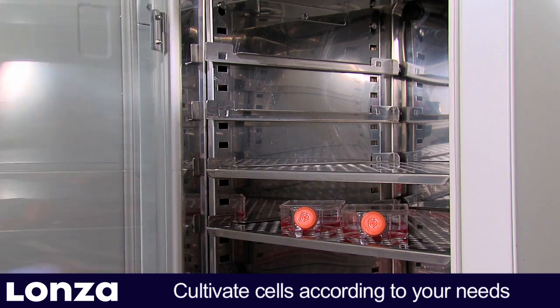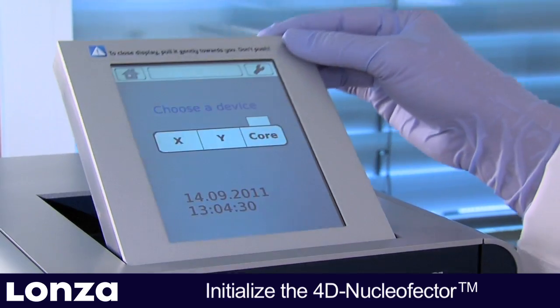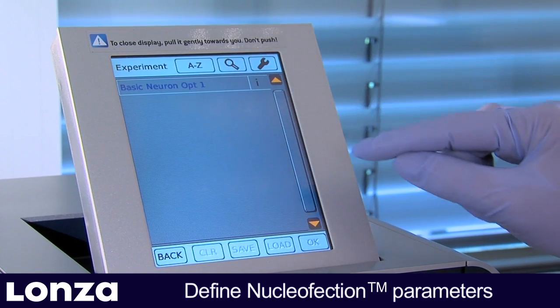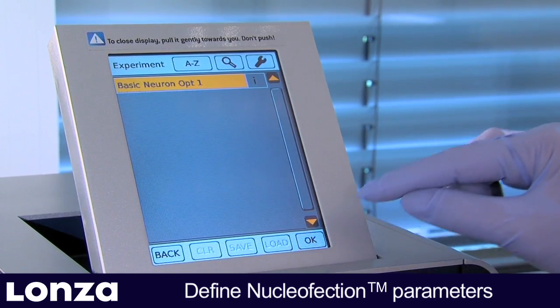Nucleaffection can be performed at any time during the culturing period. On the day of transfection, initialize the 4D Nucleaffector system and define or select a nucleaffection experiment. For the initial optimization experiment, choose the template parameter file predefined by Lonza.